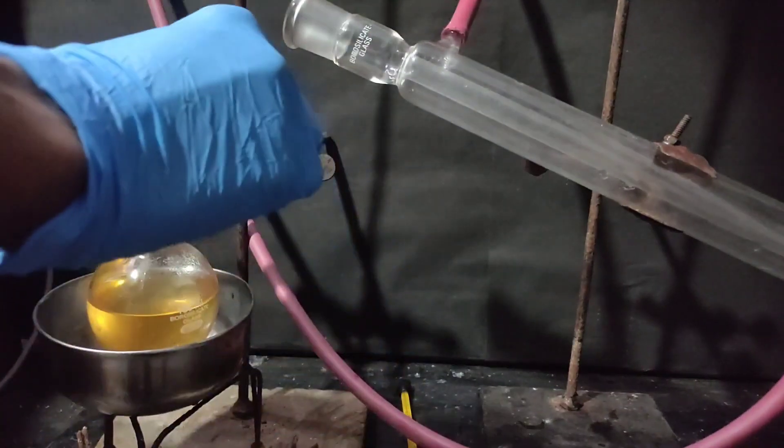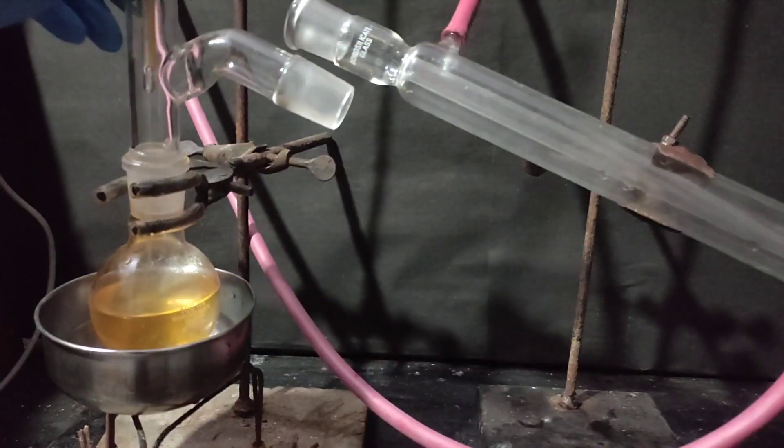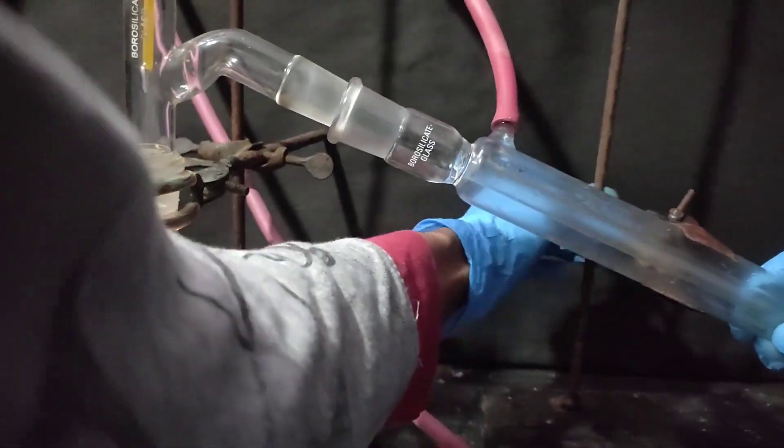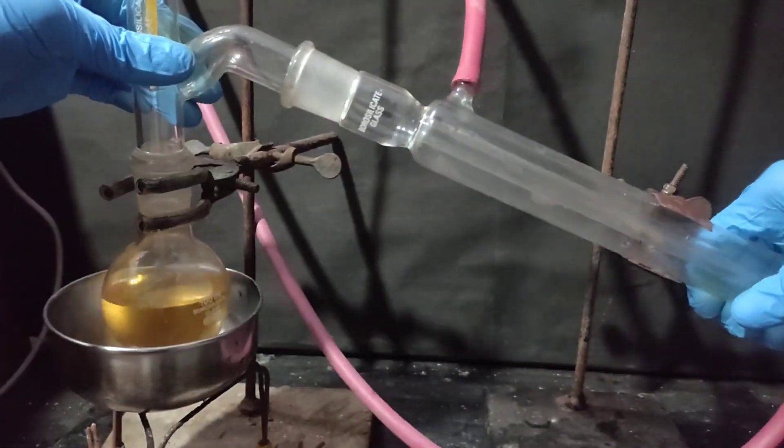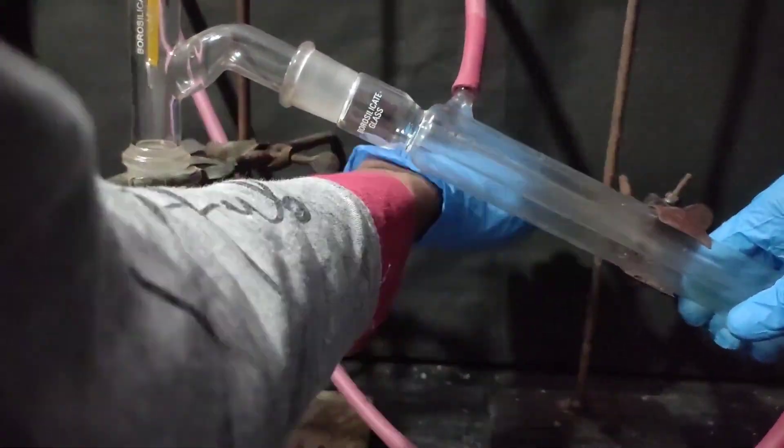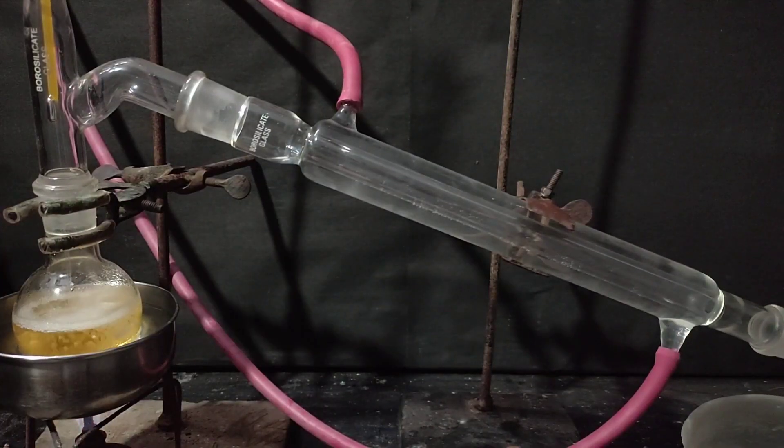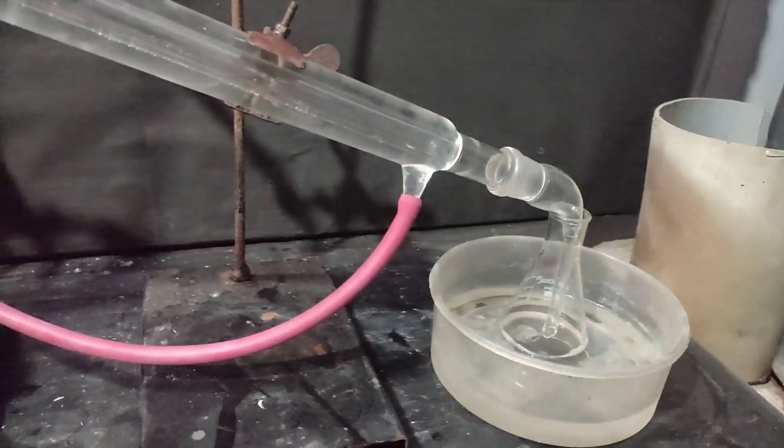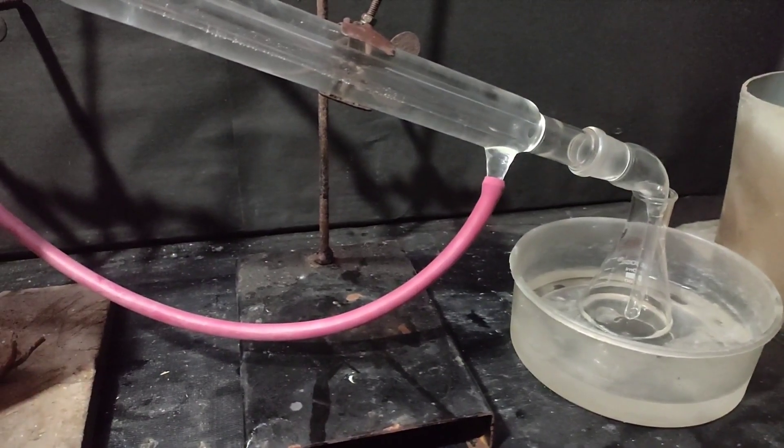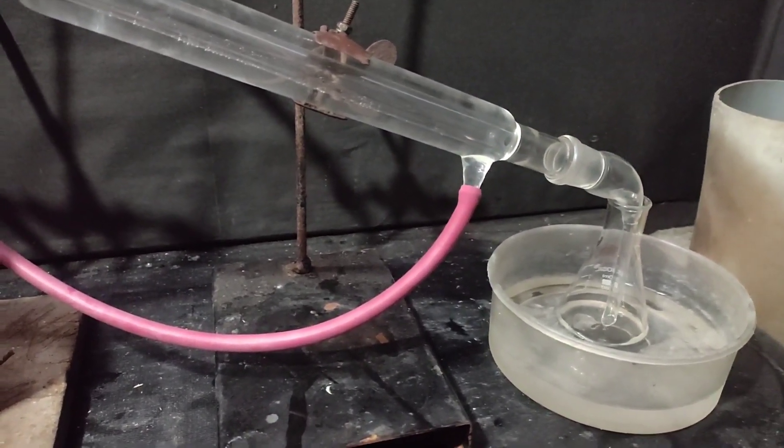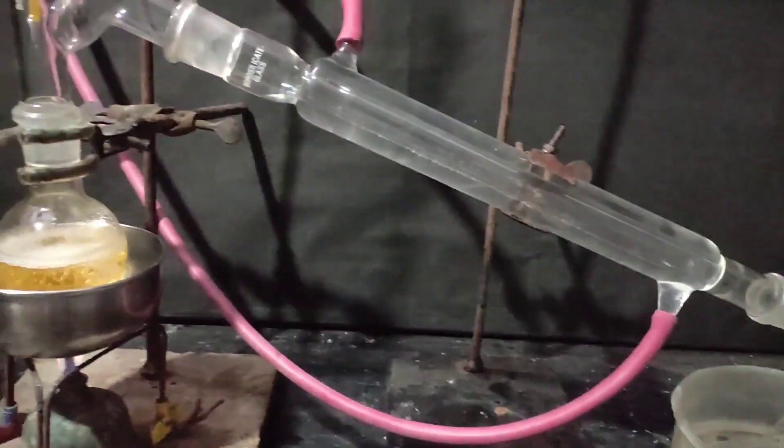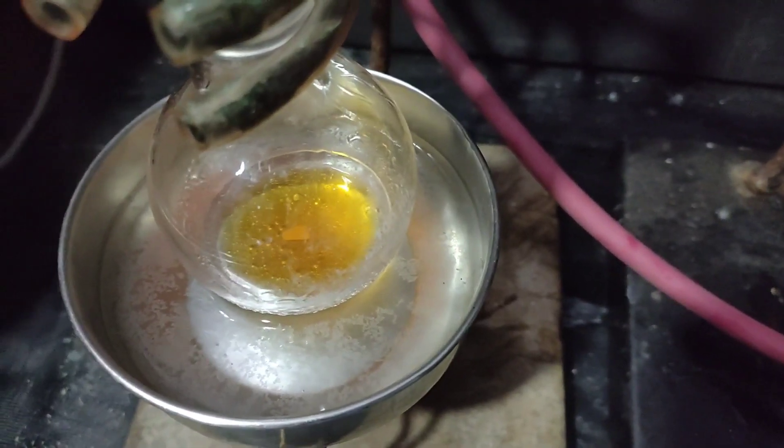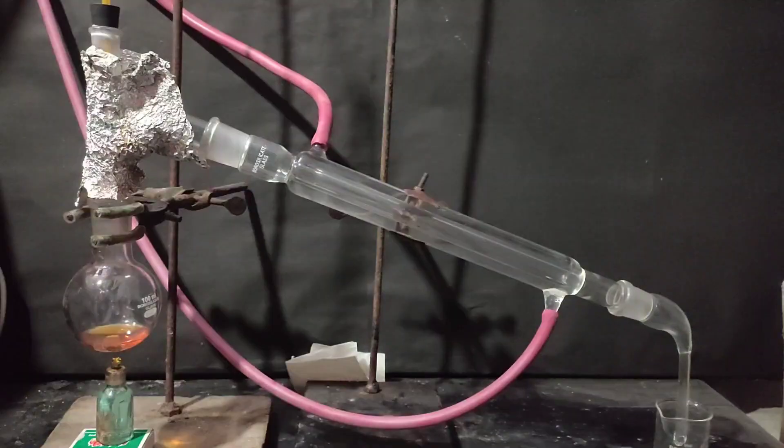Now I placed the flask in a water bath and placed a boiling chip into it. Then I placed a still head with a mercury thermometer and arranged the apparatus for simple distillation. Ice cold water was circulated in the condenser and the water bath was heated. The receiving flask was cooled in an ice bath and the ether was collected. When no more ether was collected and boiling stopped, the water bath was removed.